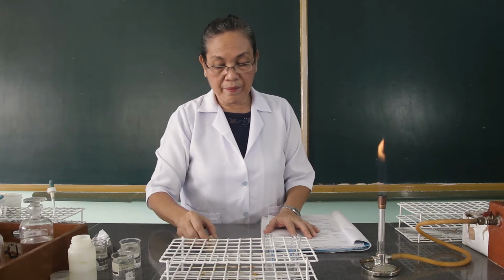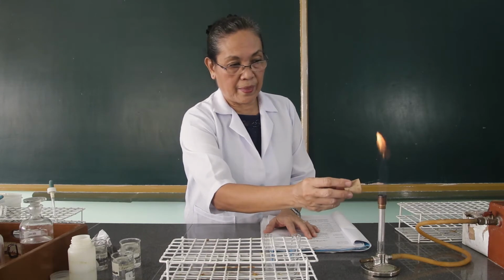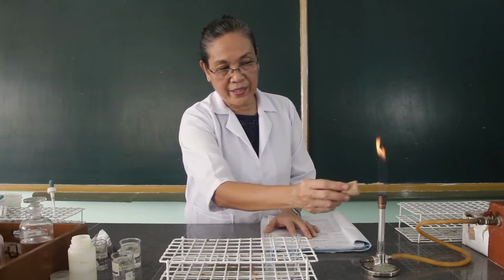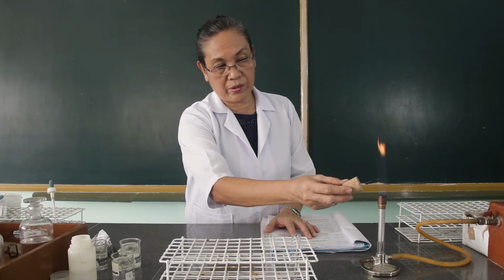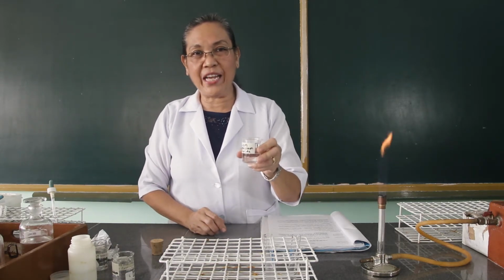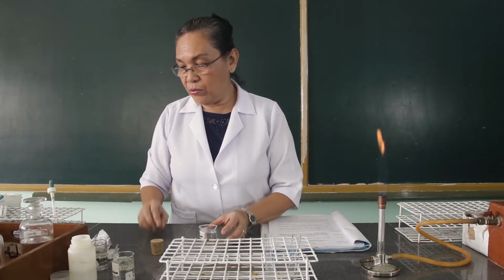Okay. Test again. So it seems no more other color imparted by the nichrome wire. So this is now ready to be used. So we're going to get the magnesium chloride solution and test this over the flame.